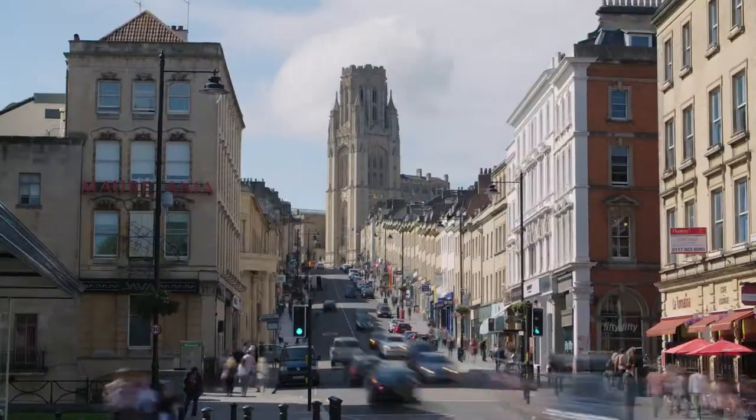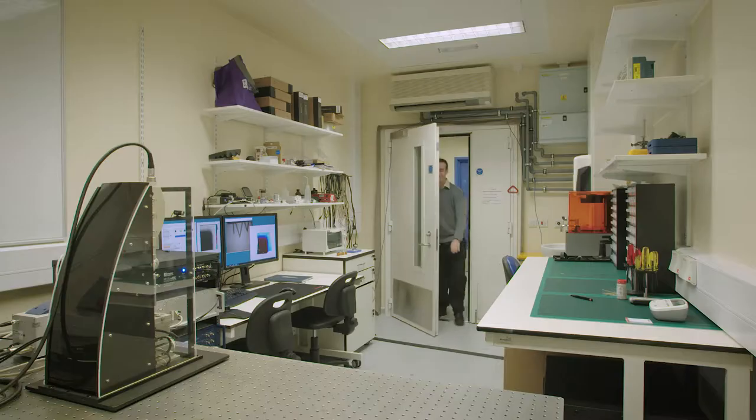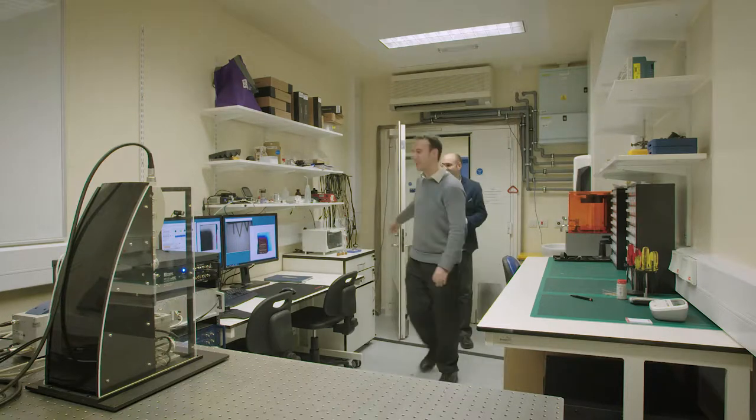Following significant recent investments from the University and the Research Councils we have a suite of unique and cutting-edge instruments to analyze materials of all different types. To ensure the best possible impact from this capability we're opening up this amazing resource to be used by industry.